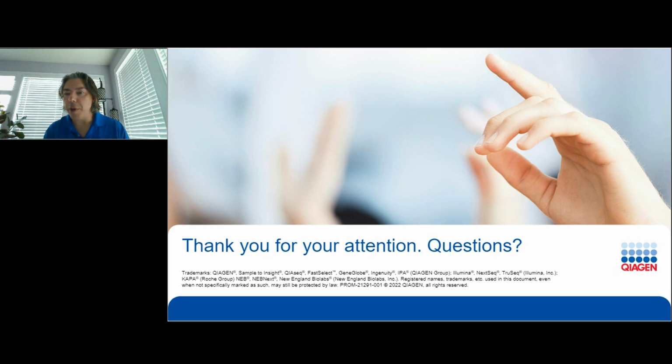A couple other questions in here are about the types of samples that we've tried. We try to keep our website up to date. So if you search for QIAseq FastSelect on the QIAGEN website, or you can probably just Google that, you'll find that we try to update whatever samples we have. The other place I like to look is Google Scholar. In Google Scholar, type in QIAseq FastSelect. It's a very unique name, FastSelect, and the reason for that is it does have a very specific match in Google Scholar for people that published it. You can find almost any sort of application it's been used for, and you can look through and see if someone's tried it on the samples that you're trying, and they've probably published data or a use case around it.